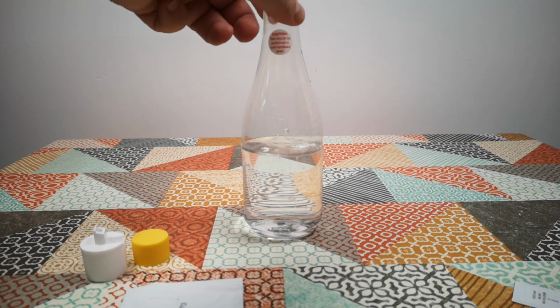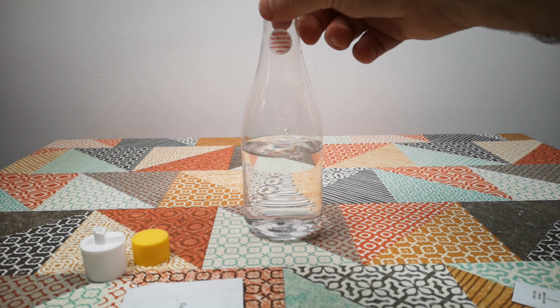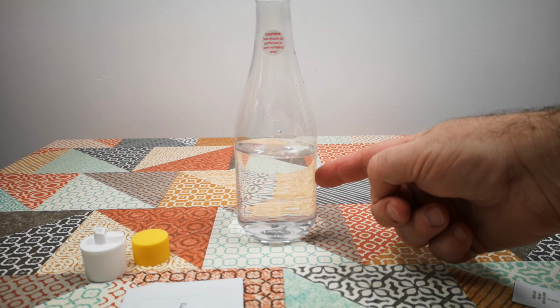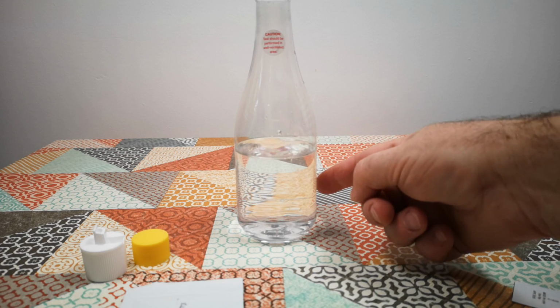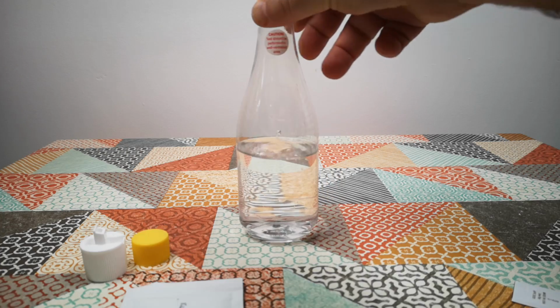Okay, so in detail, here's how this test works. I'm filming this part after I've already done the 3 main tests. I'm actually going to retest. This is water from my hot tap, which I've allowed to cool down. So we're going to test whether my water heater is introducing arsenic into my washing water.